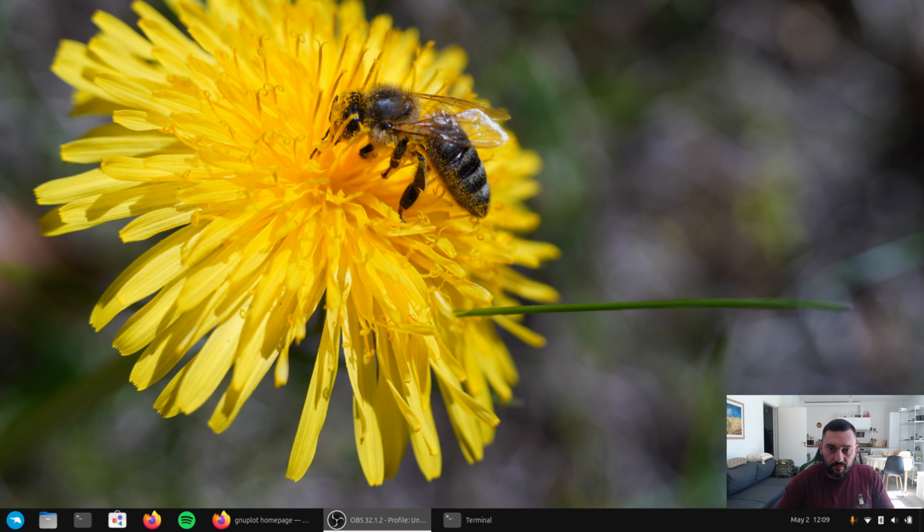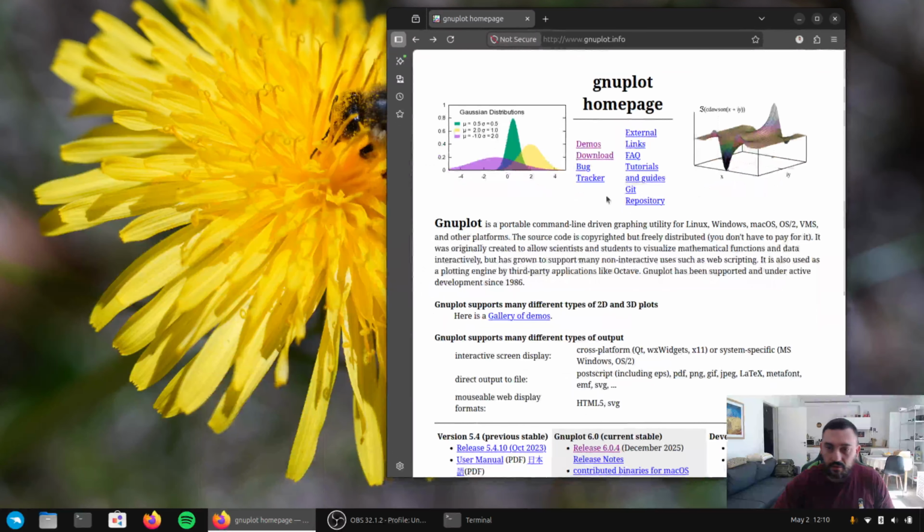The purpose of this demo is basically to log the data from the device into a CSV file using a C program, performing the calls to the SDK, and to visualize the data. I'll show live visualization with the gnuplot engine.